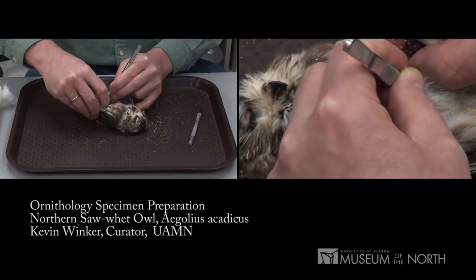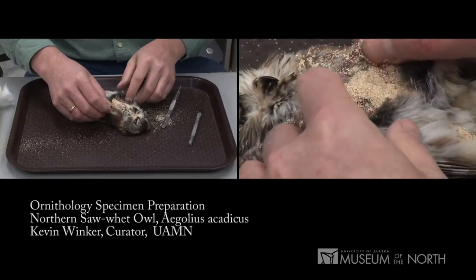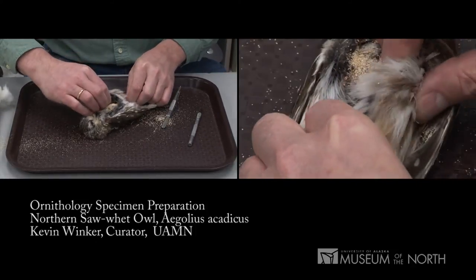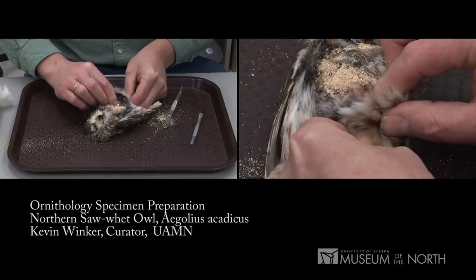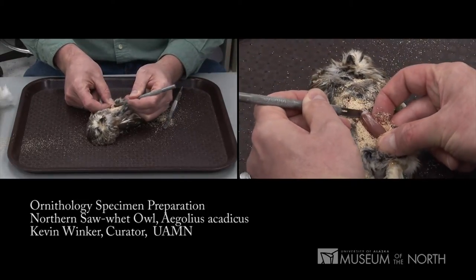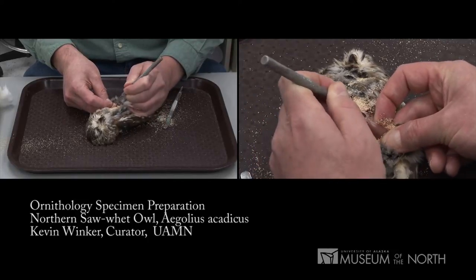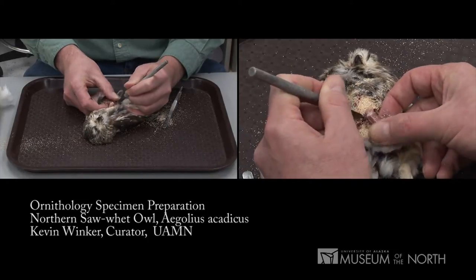What I want to do now is expose the legs so that I can stick the knees out and cut them free. I'm doing this by touch mostly, but you can see the knee popping free. I will disarticulate that with my scalpel, separating the knee from the rest of the leg.